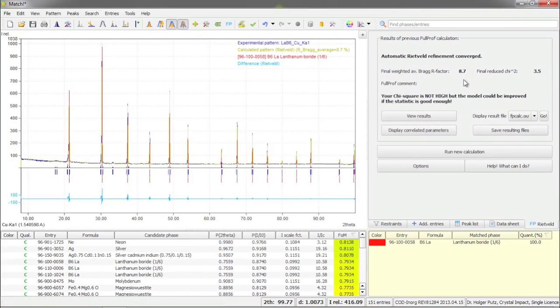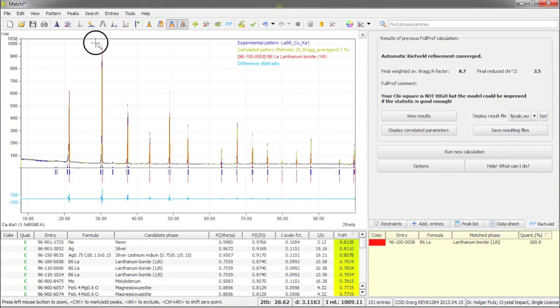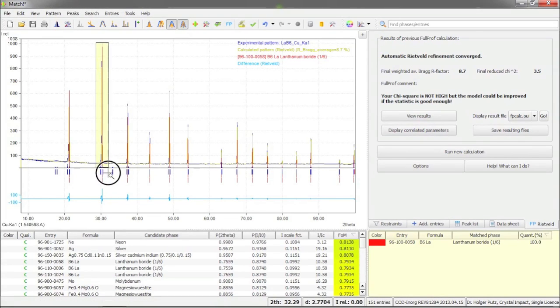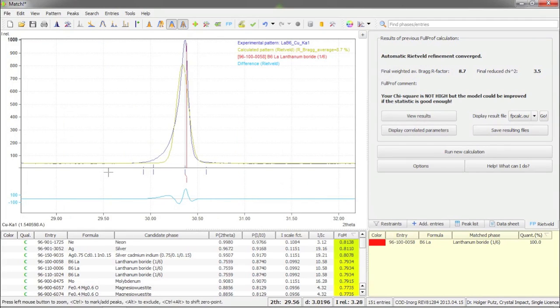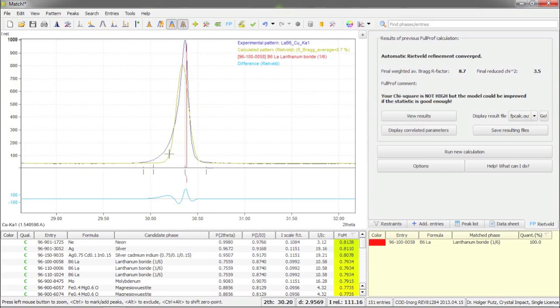Well, the result of the calculation is not bad, but the question is can it still be improved? In order to check this I would like to take a closer look at the strongest peak in the diffraction pattern and zoom into it and compare the profile from the experiment to the one resulting from the Rietveld refinement.